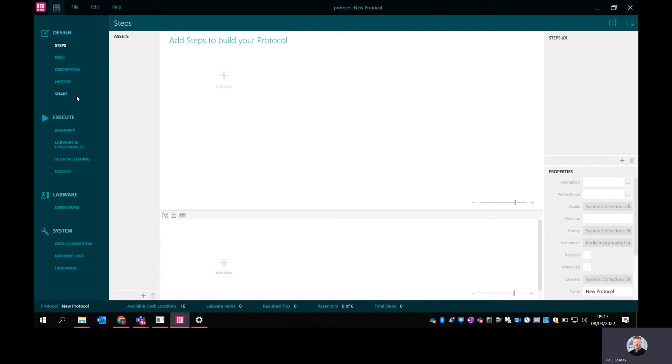This could be inaccessible to some users. If you choose to lock the system down for certain users so that when they log in, they can only select and run protocols, then they will simply see the execute part and have very limited ability to do things. Here I'm looking at it from the point of view of an advanced user who has access to everything.